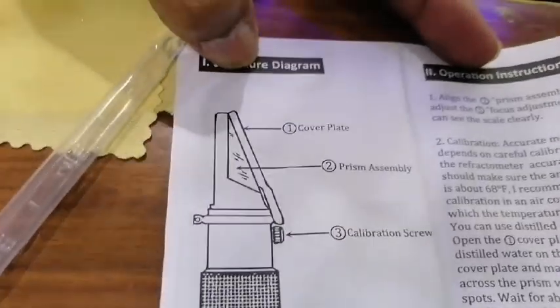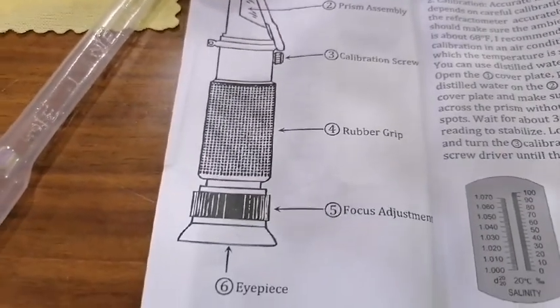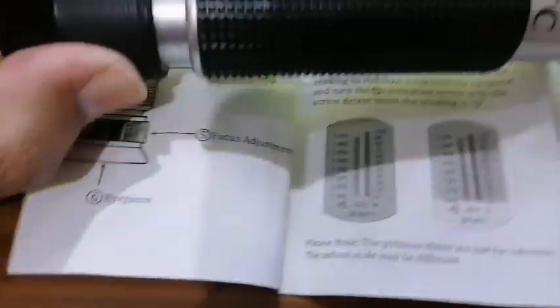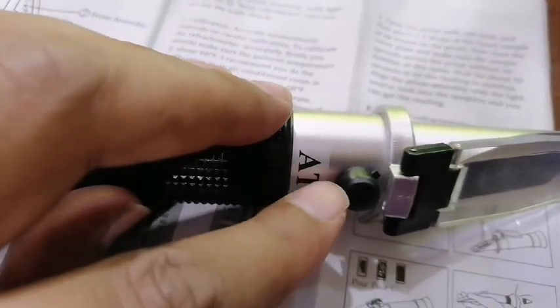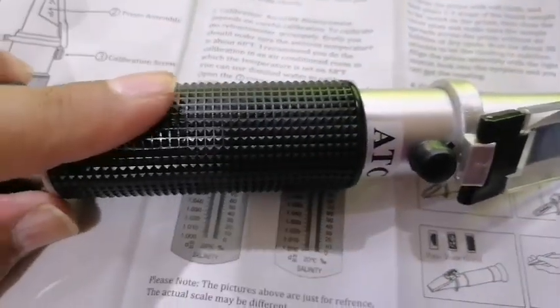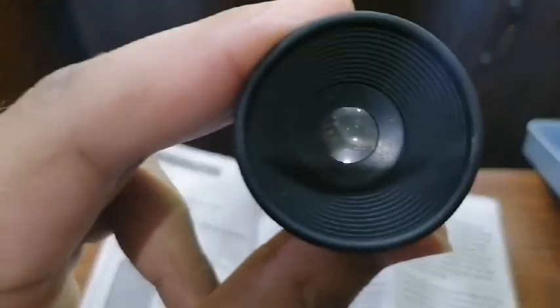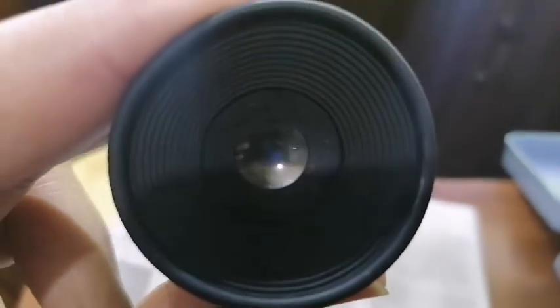The parts are: number one, the top cover plate; number two, prism assembly; number three, calibration screw; number four, rubber grip; number five, focus adjustment; and number six, eyepiece. Here are the parts — the prism, the screw for adjustment or calibration, the rubber grip, and the eyepiece for looking inside. As you can see, there is a little bit of blue color inside.